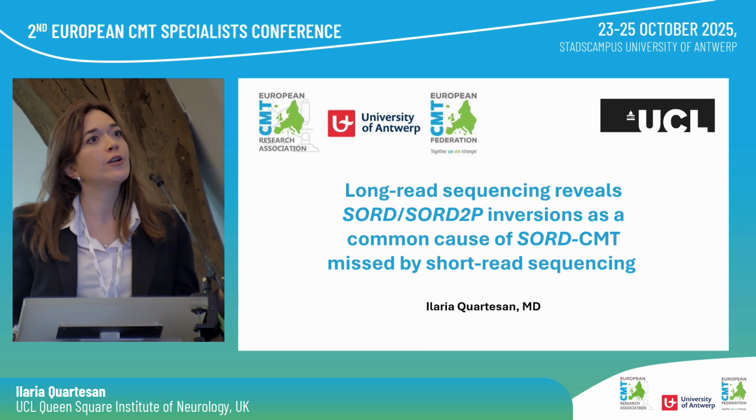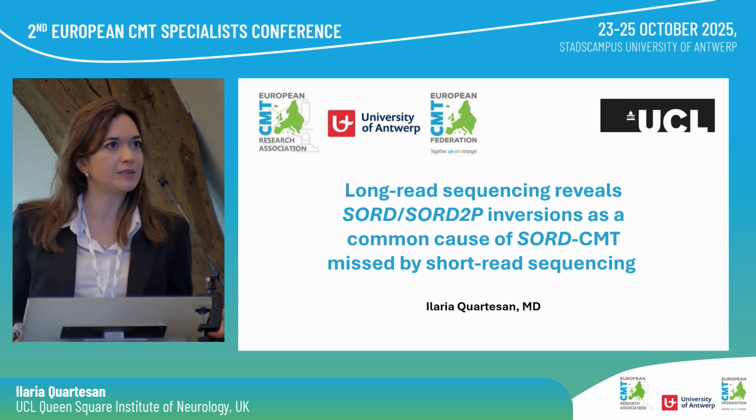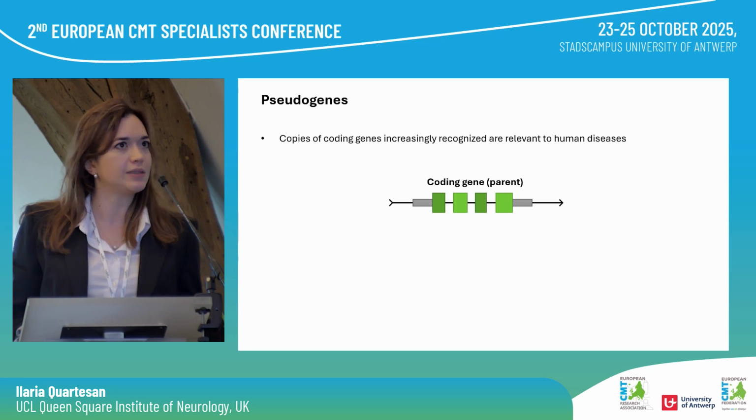So today I'll show you how long read has revealed a common but so far hidden cause of SORD-CMT, namely a gene-pseudogene inversion. Pseudogenes are copies of coding genes that were once considered non-functional but are now recognized as relevant to human disease.